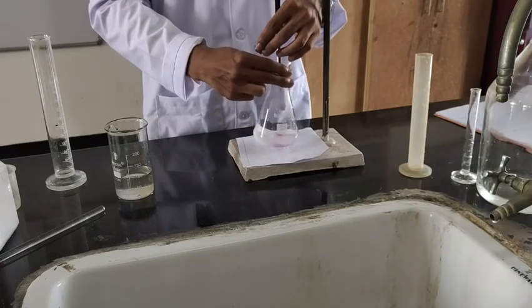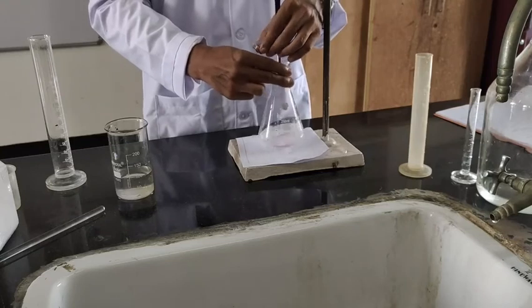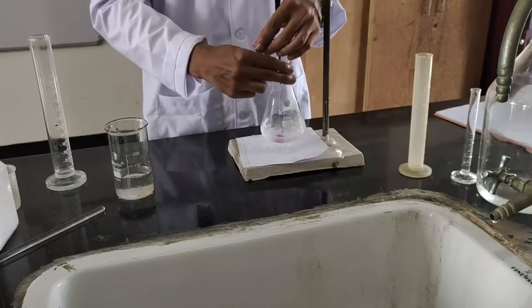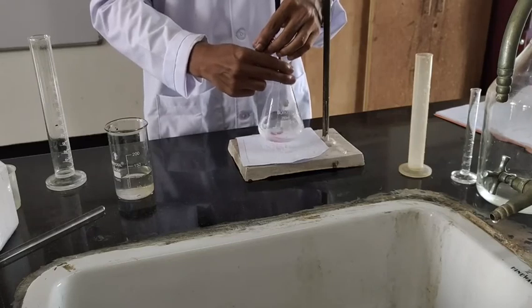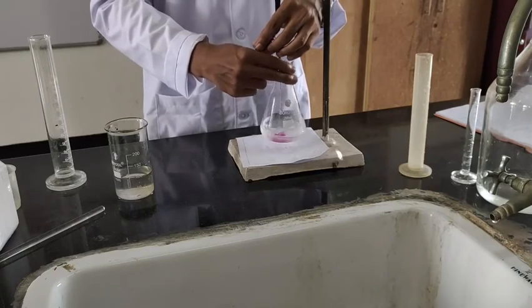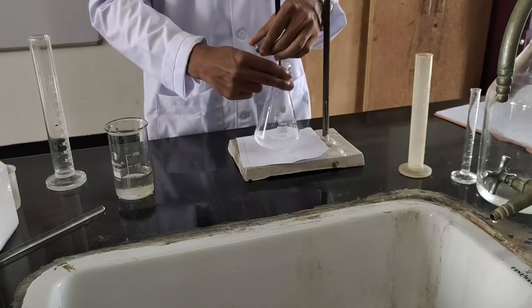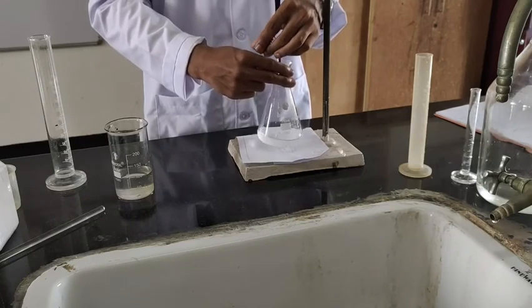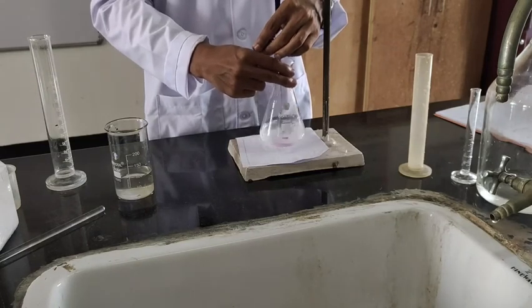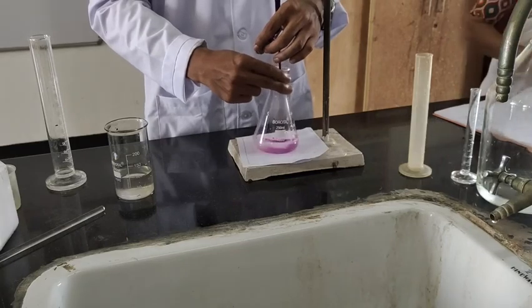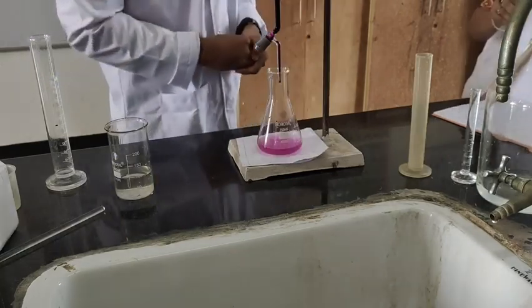Put the potassium permanganate solution dropwise and look for a constant pinkish color. You can see here the pink color has appeared. This is the end point of titration.